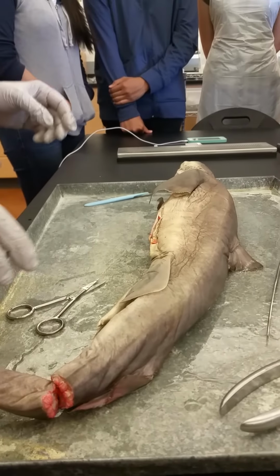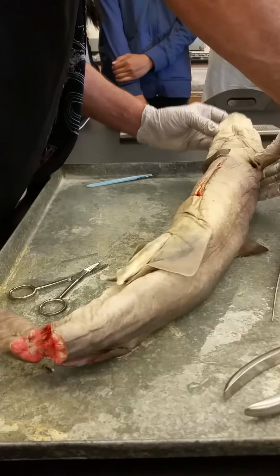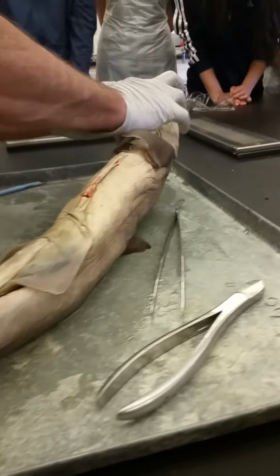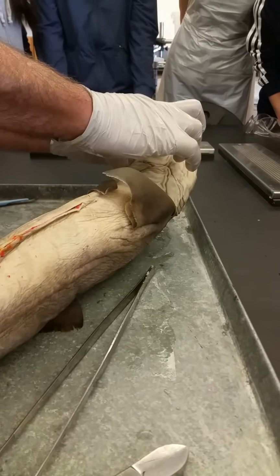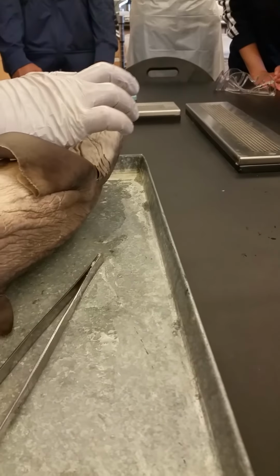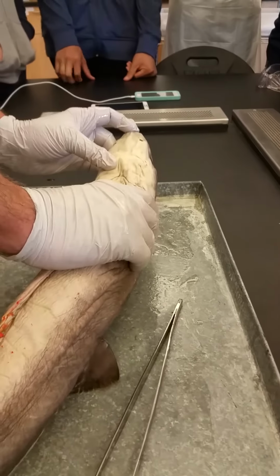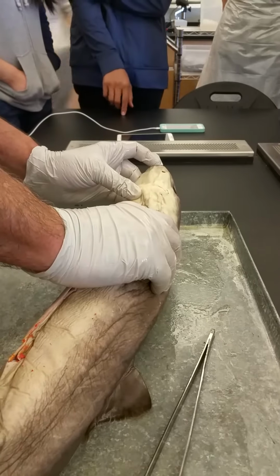In addition to those senses, another sense which we'll talk about in lecture a little bit are these little black pits all over their snout. See those little black dots? They're actually tiny pores all over their snout here. And that's not acne. It's a structure called the ampullae of Lorenzini, and they're electrical sensors. They can actually detect electrical fields.